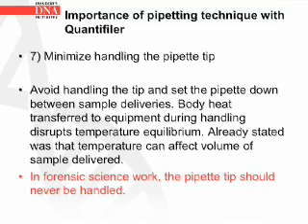Number 7. Minimize handling the pipette tip. Avoid handling the tip and set the pipette down between sample deliveries. Body heat transferred to equipment during handling disrupts temperature equilibrium. Already stated was that temperature can affect the volume of the sample delivered. In forensic science work, the pipette tip should never be handled.